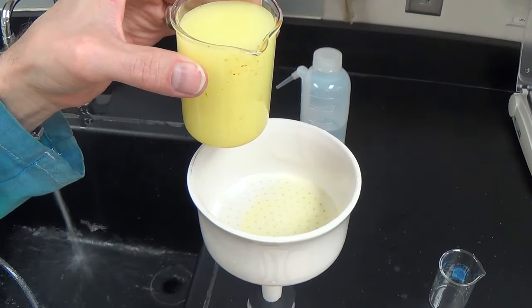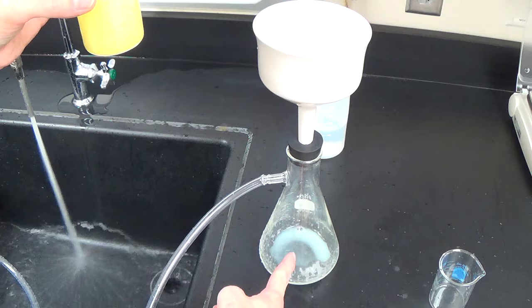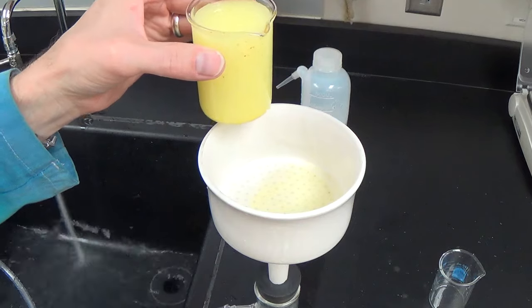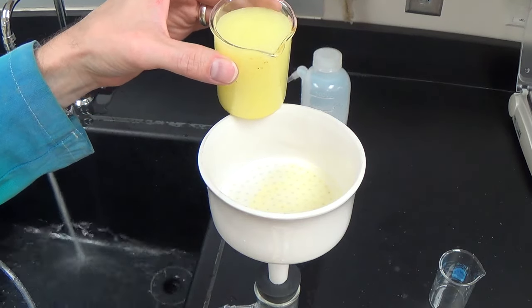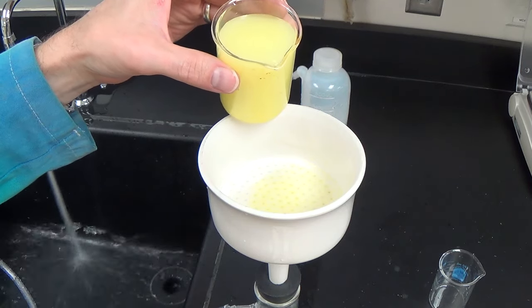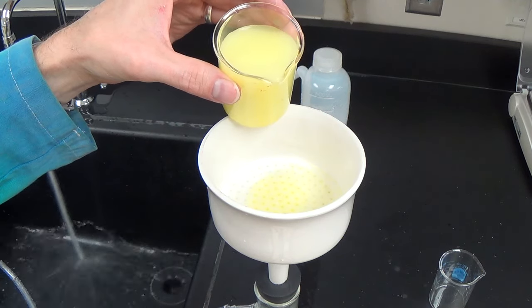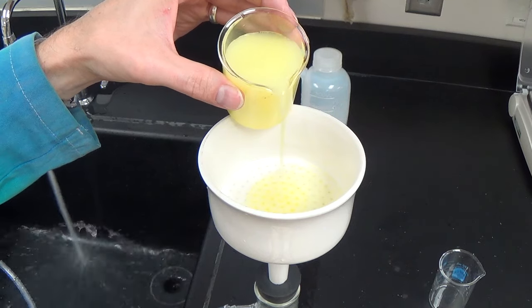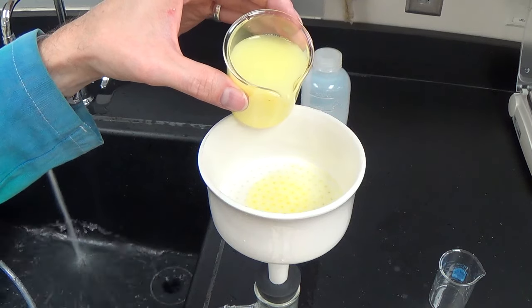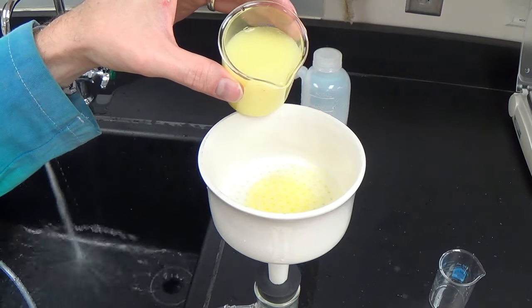Now I want to scoot this back for a moment. Okay, notice how we're getting liquid down through the flask. Hopefully that's none of your precipitate and all of your filtrate is going through there. And now you can imagine you're like, well, I'm pouring slowly. Yeah, you're pouring slowly, but it's certainly going a lot faster than if you had to pour it into a funnel and wait for it to filter that way.